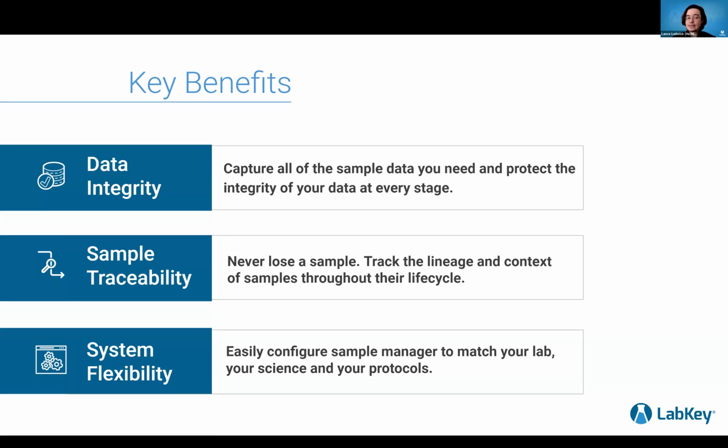So today we'll look at a system that's set up for a more clinical diagnostics system, but just keep in mind, we can work with a variety of different sample types, such as dirt, rocks, blood, plants. We can also have as many different data fields as you need associated with your samples. So we're not going to limit what types of information that you're capturing.